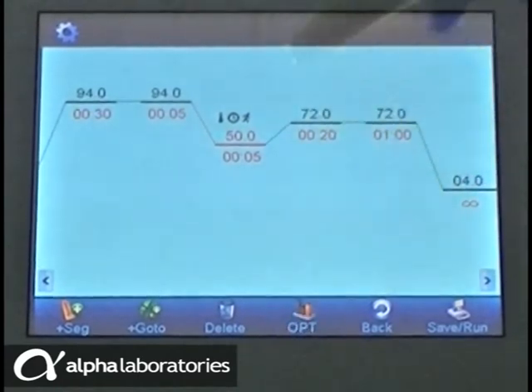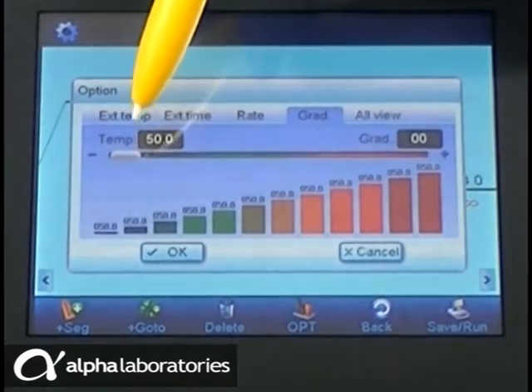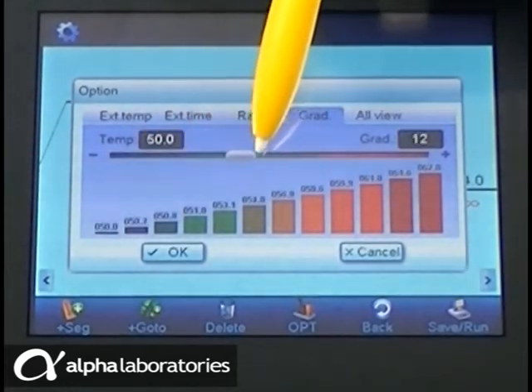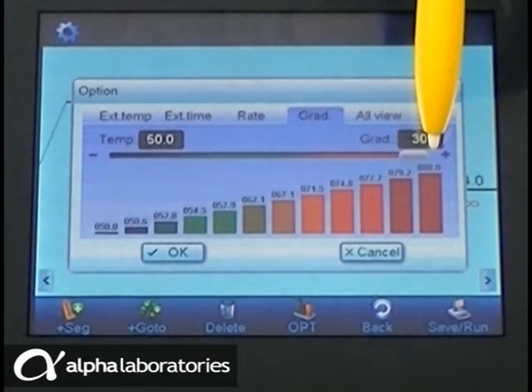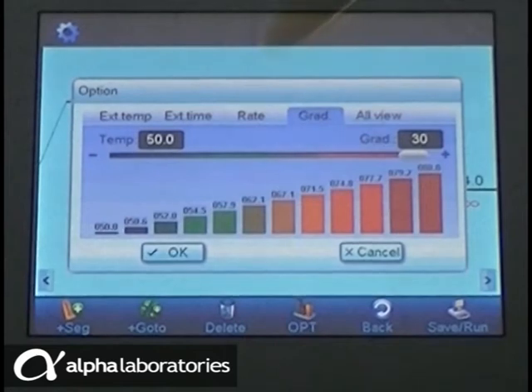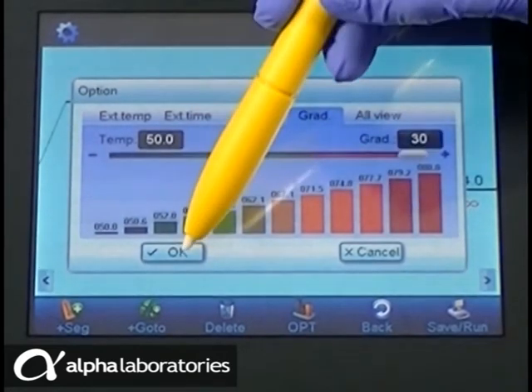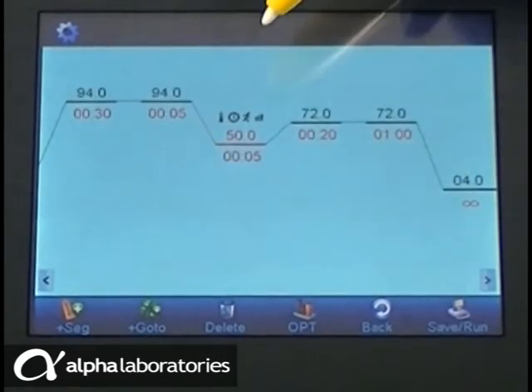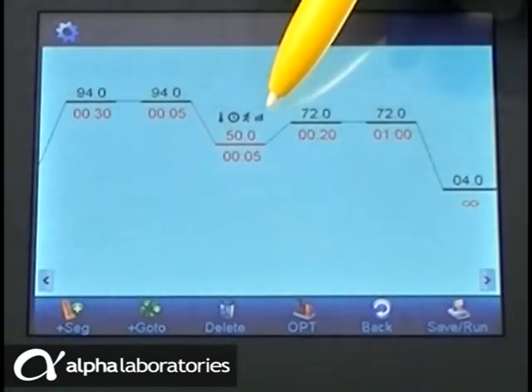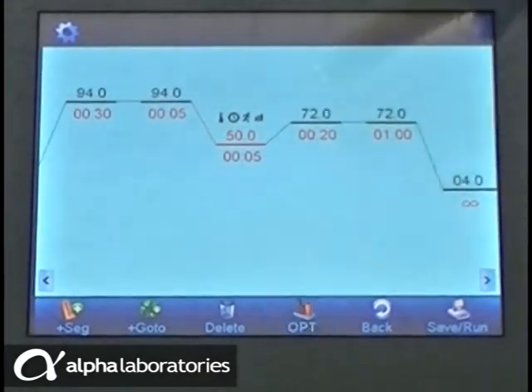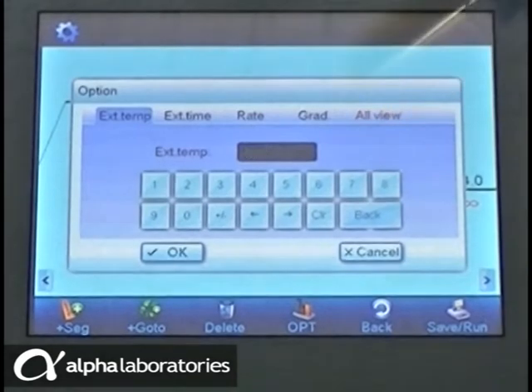A gradient is a useful tool for the optimization of your reaction. Use the sliding scale to define the spread of annealing temperature across each corresponding column of wells with a maximum variation of 30 Celsius. When a gradient is applied, this is indicated by the graphical symbol. The All view presents a summary of the options applied.